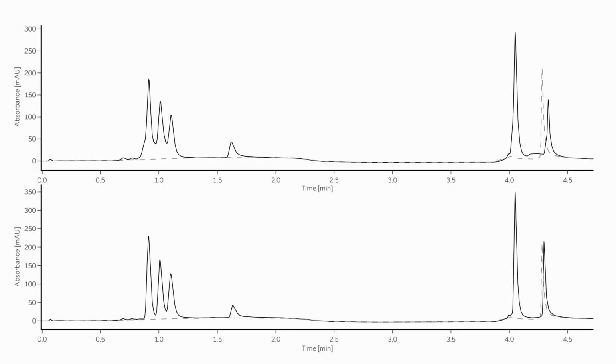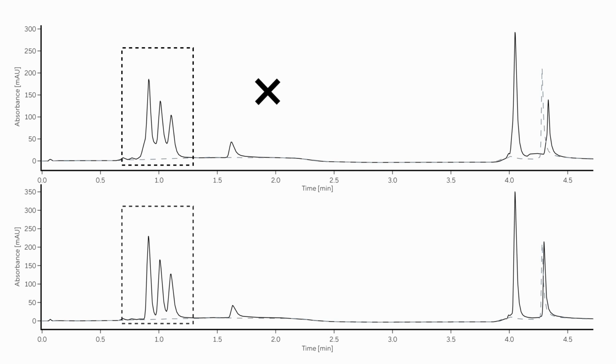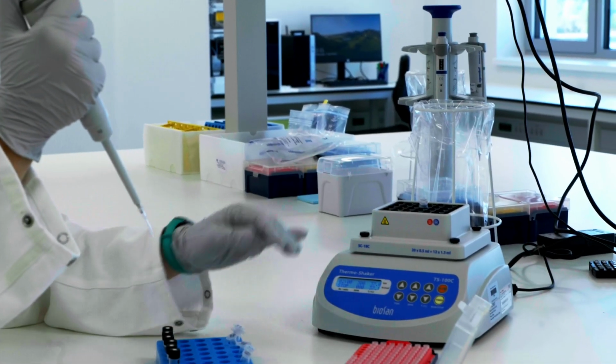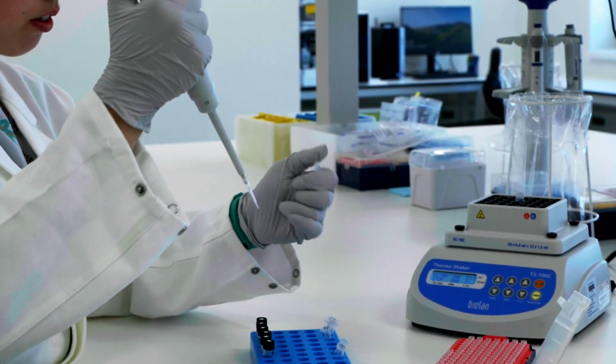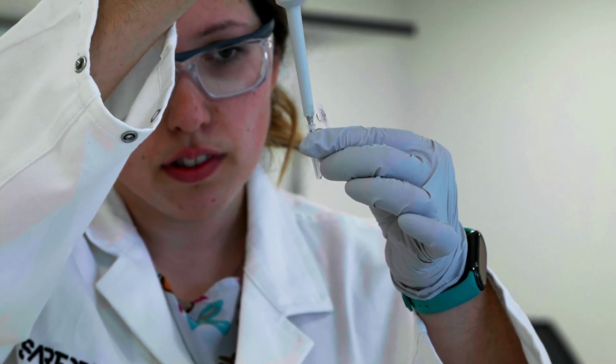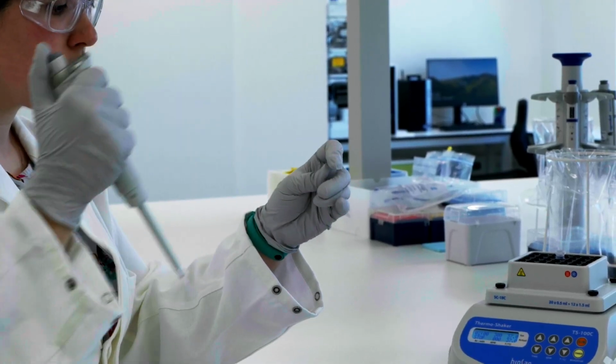If the separation of all components is within expected parameters, we can proceed to the injection of the calibration curve made from our provided mFix4 standard, and after that, our samples. When optimizing an IVT protocol, we sample the reaction over time, usually every 15 to 30 minutes, depending on the protocol we are using and the results we are expecting.